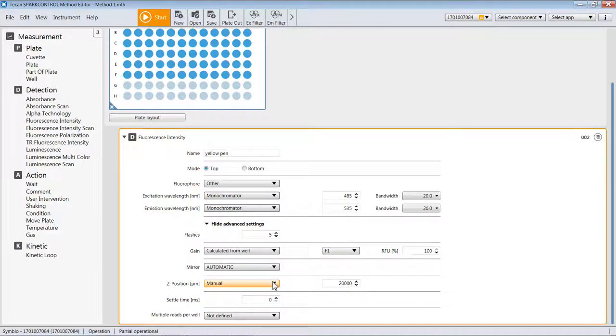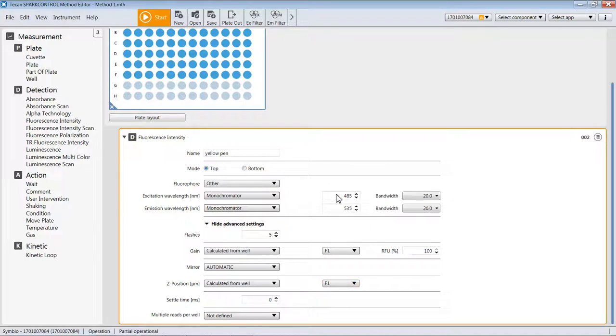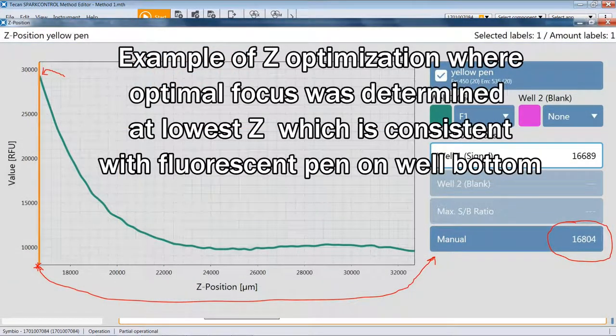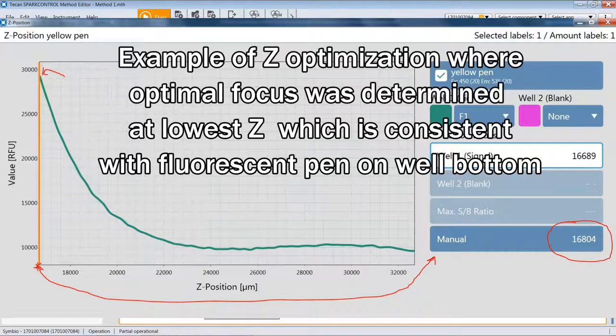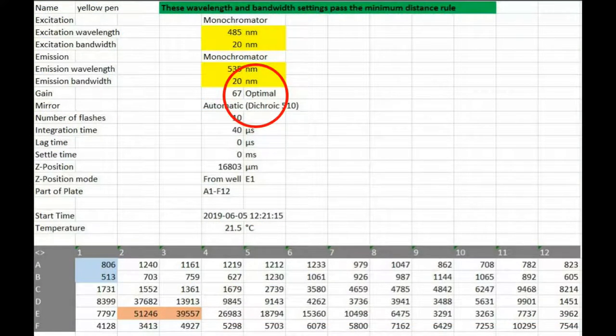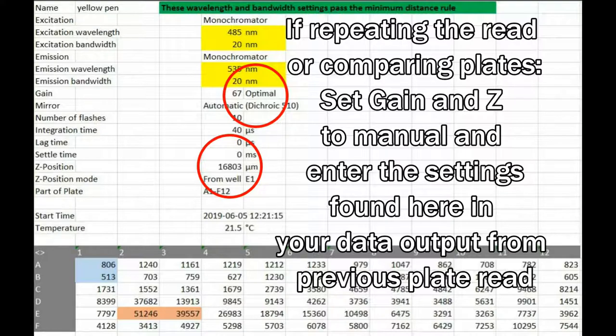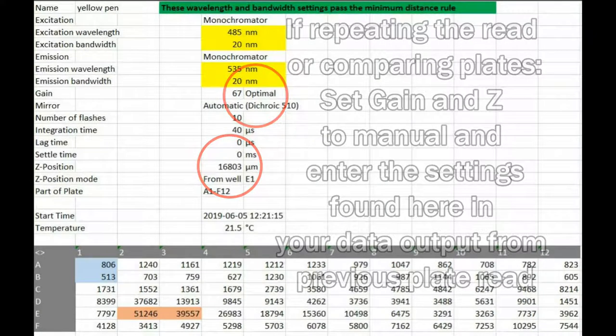The Spark can move the plate carrier up and down in the Z direction, much like a microscope stage, in order to focus at the right depth within a well. If you set this to automatic or calculate from well and designate a well that you know to have some fluorescence in it, perhaps sending it to F1, it doesn't have to be the well with the brightest sample, but certainly a well where you know there is definitely some representative fluorescence. Then the instrument will move the plate carrier up and down, identify the depth at which it gets the best signal, and then it will read the entire plate at that depth. It will also report this Z position and the gain values it's determining here in the data output, so you can use those values again should you want to repeat the reading.